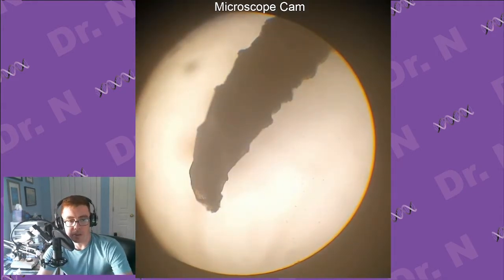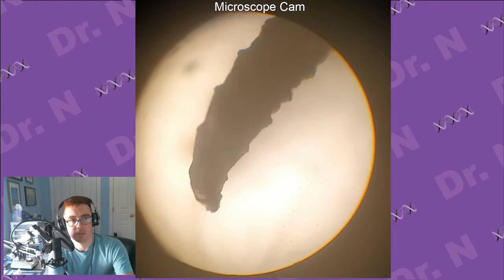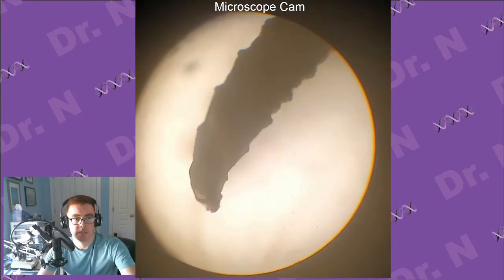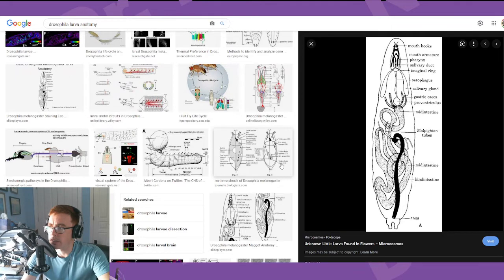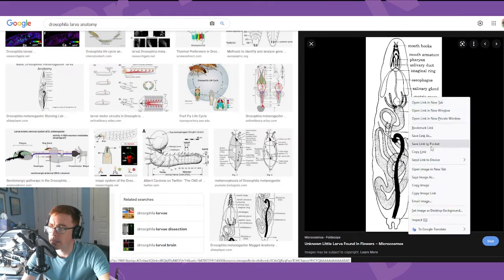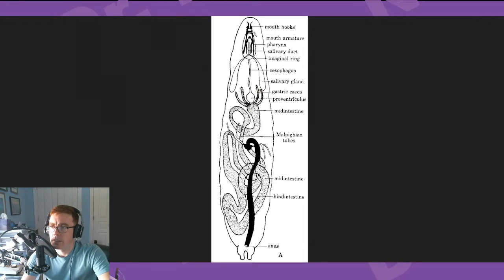Let me quick just pull up a comparison so we can actually see what we're looking for. None of these are great. That's fine. Yeah, so those are the mouth hooks that I mentioned. So those are up near the head. It has a mouth right here in the middle. It's missing its brain in this image, which is kind of right about here.